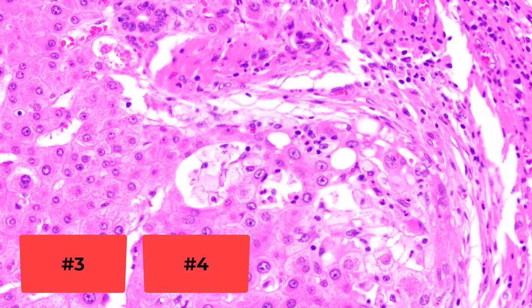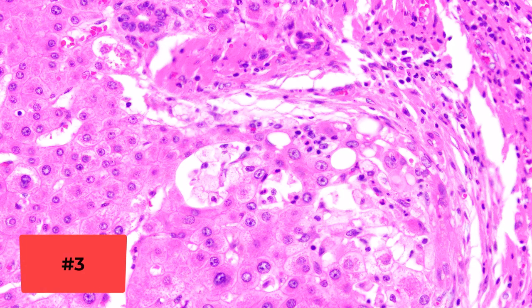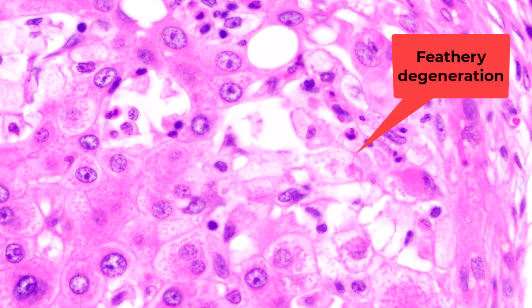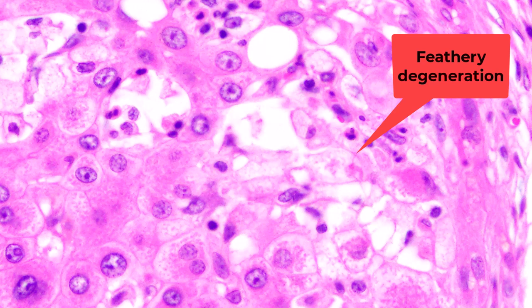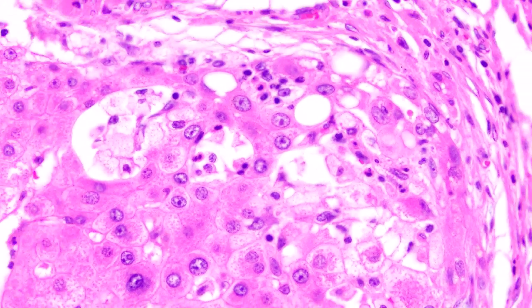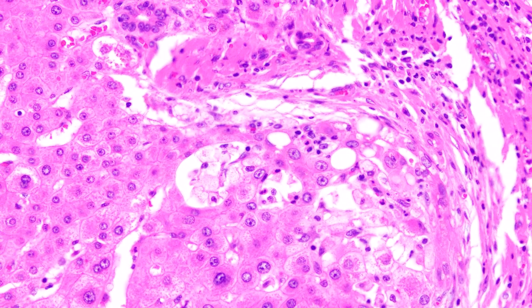Feature number three: the hepatocytes are enlarged with pale to clear cytoplasm. This is the so-called feathery degeneration, again precipitated by the accumulation of bile salts, and typically seen at the interface between the hepatic nodules and fibrosis.